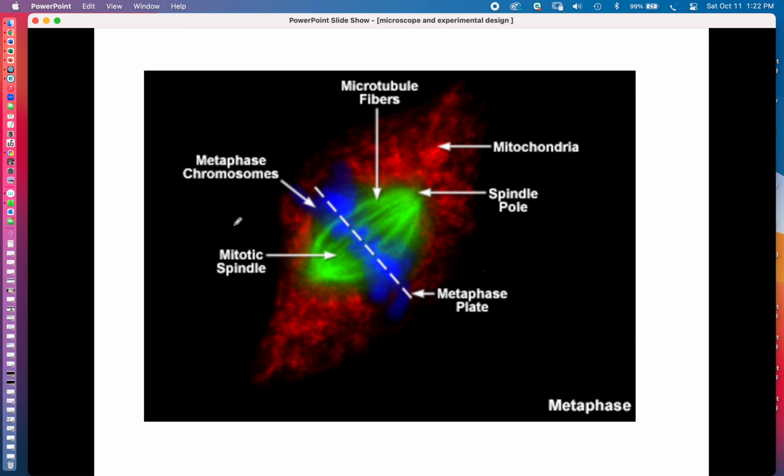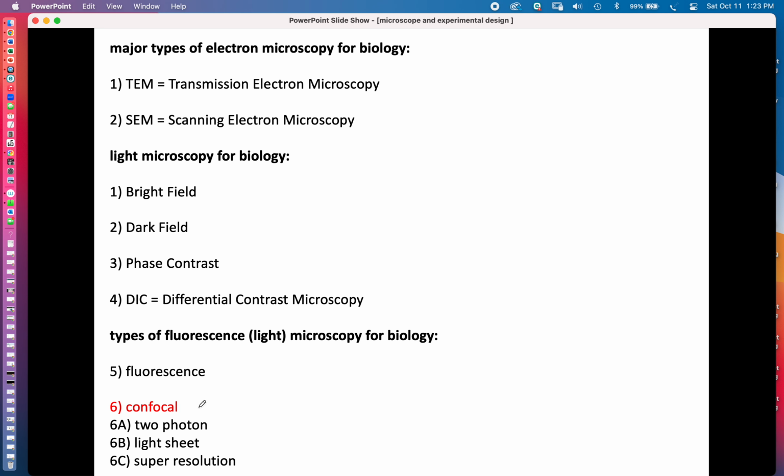And so we start out with UV light shining on it, excitation light, and that can't be seen by us. It's a very short wavelength, but when the light is absorbed and then re-emitted as fluorescence by this stained sample, we can see those lights because they're lower energy and they're in the visible wavelength. So that's called the emitted light. We have the excitation light that's invisible to us, so we see darkness, and the emitted light is what we see. And scientists can pick different pigments to glow different colors. And you can see there's very interesting detail here. And so that's an example of that. And before we go on to these others, or actually I'll show this next figure.